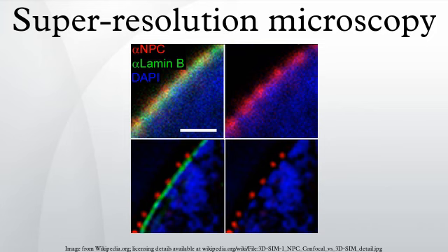Label-free localization microscopy. Optical resolution of cellular structures in the range of about 50 nanometers can be achieved even in label-free cells using the localization microscopy SPDM. Besides a substantial resolution improvement of autofluorescent structures, using two different laser wavelengths, SPDM reveals cellular objects which are not detectable under conventional fluorescence wide-field imaging conditions.